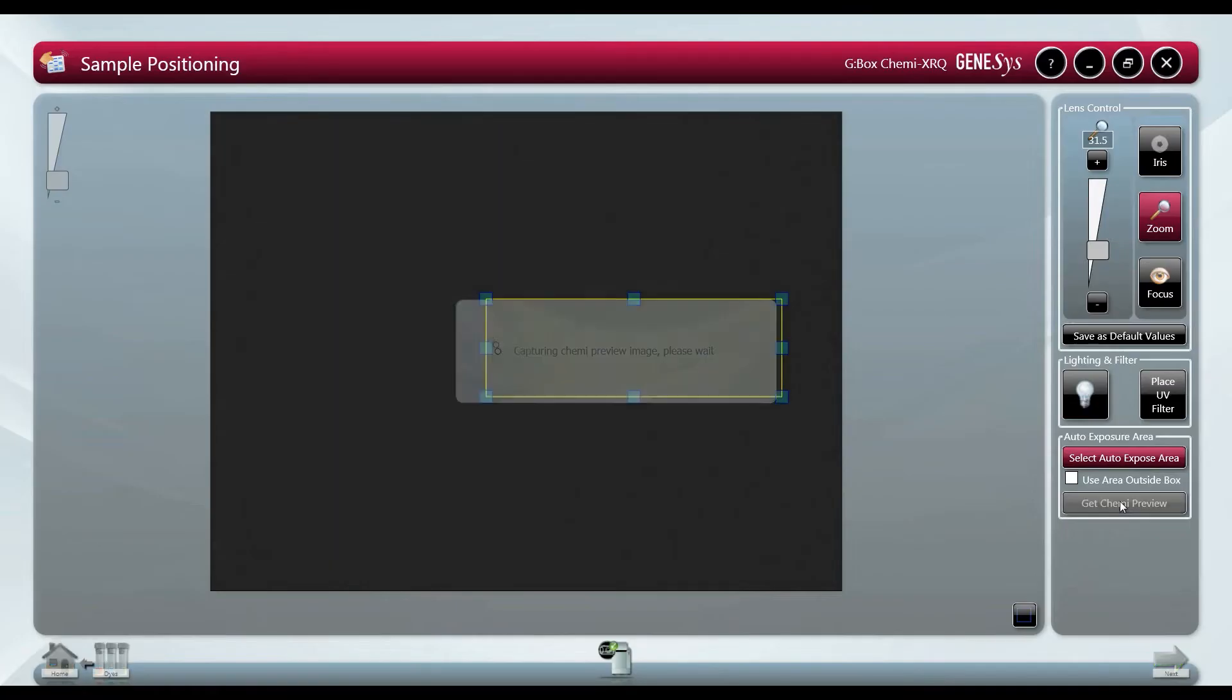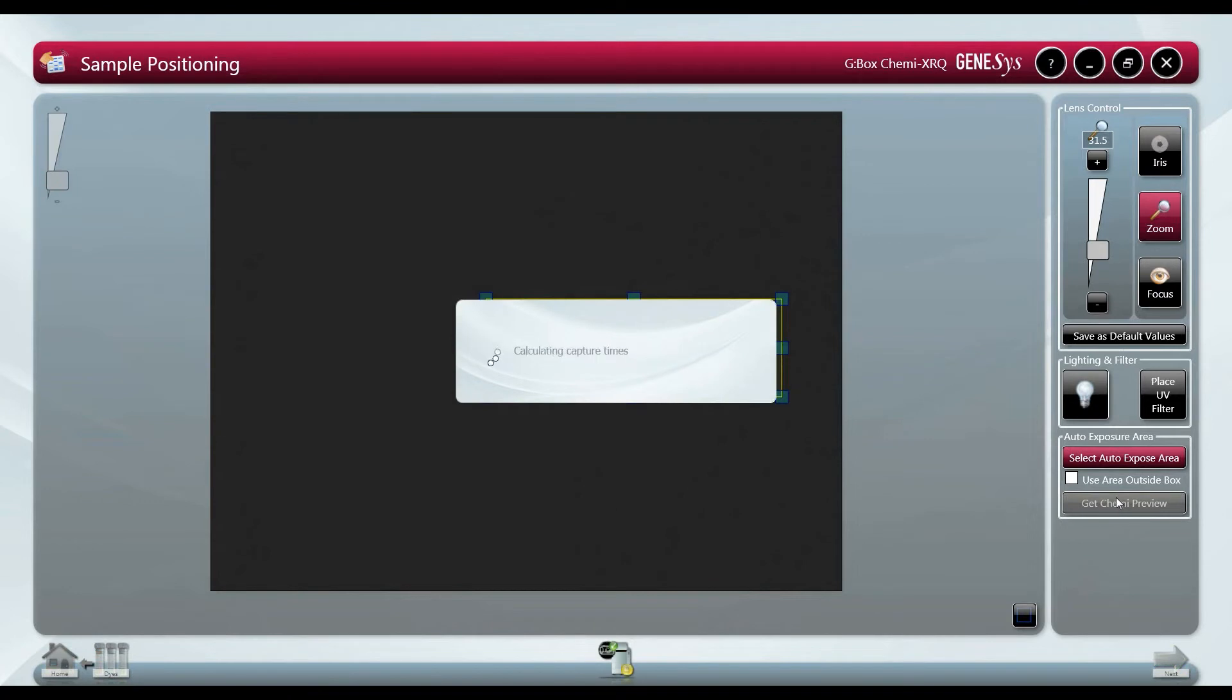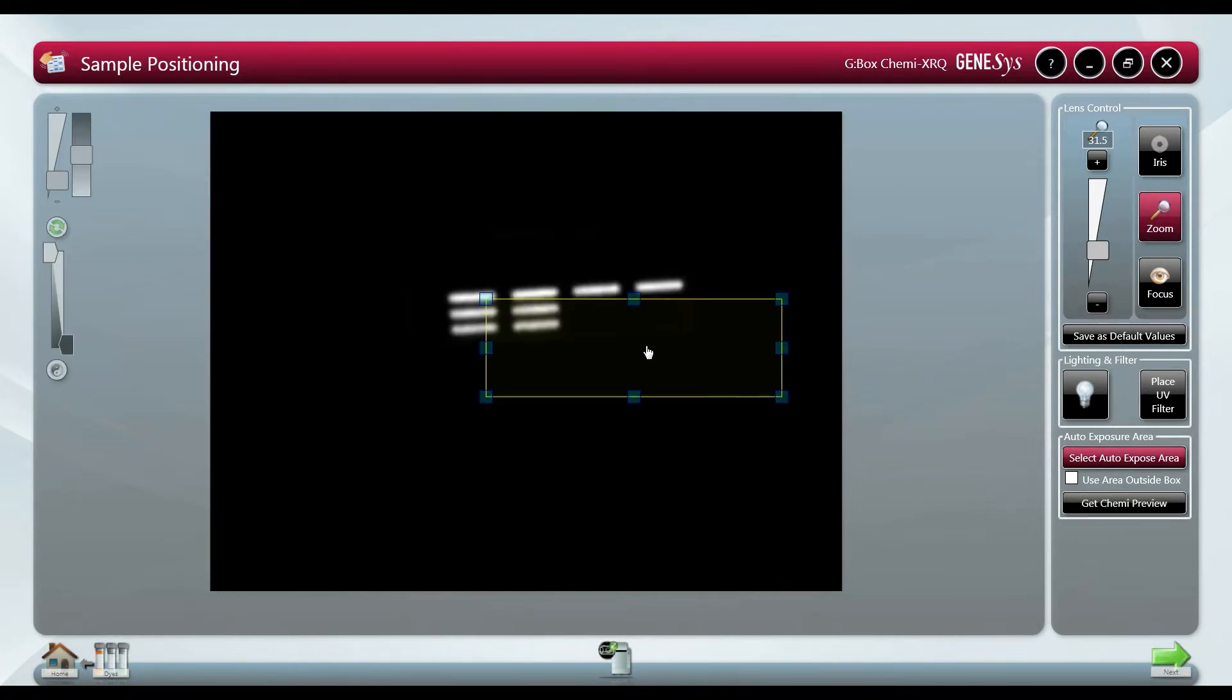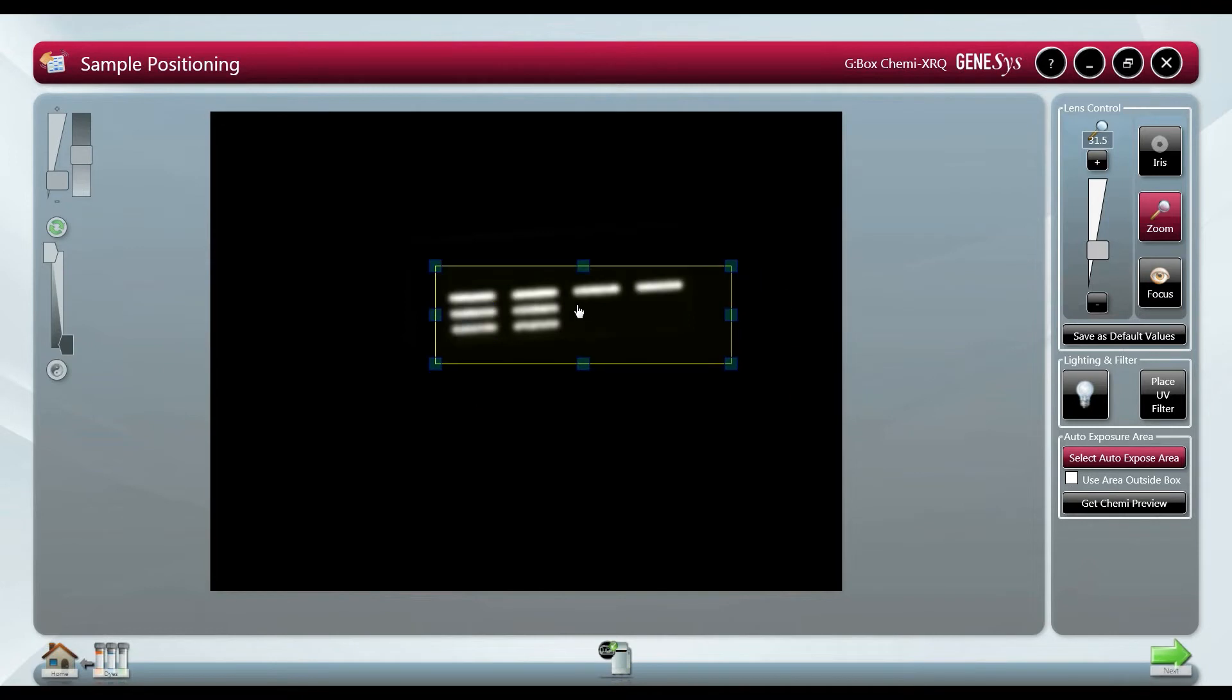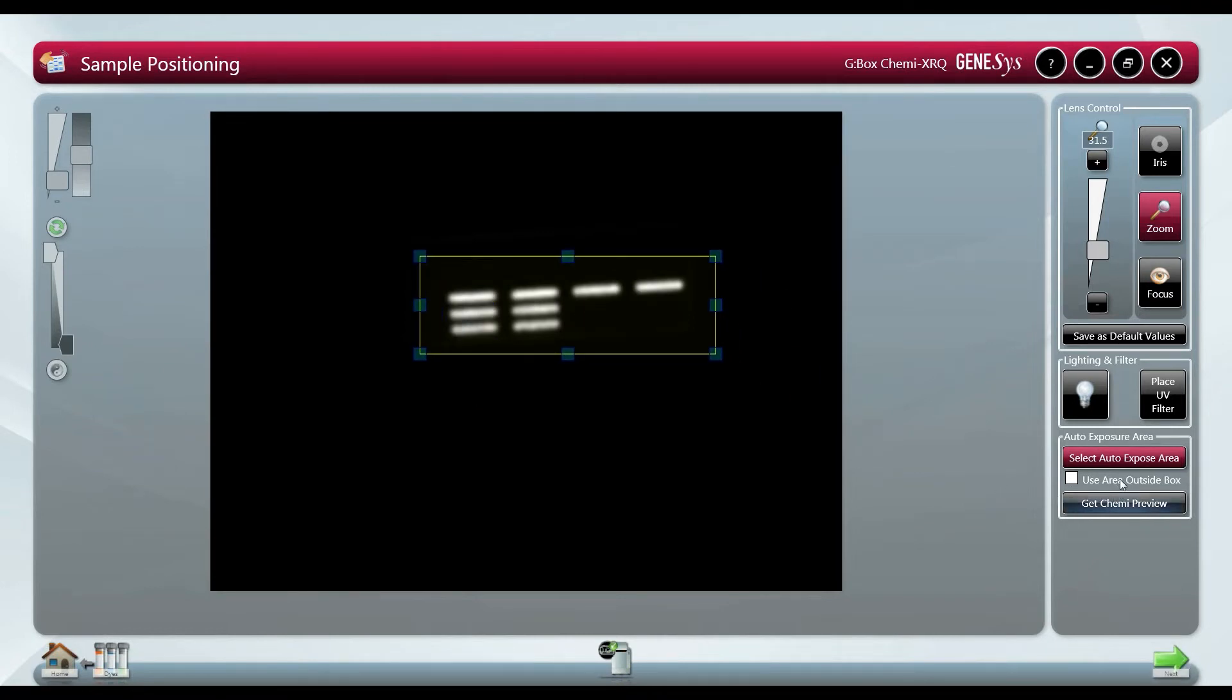Chemi preview is a feature which enables the user to quickly see the positioning of bands and then decide which areas to focus on for the imaging. This allows us to use auto expose area which is a powerful feature if you have both bright and faint bands on the same blot.